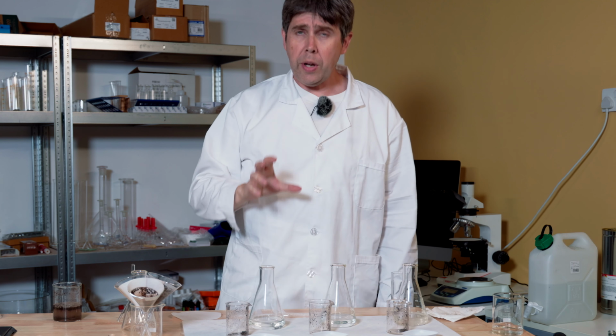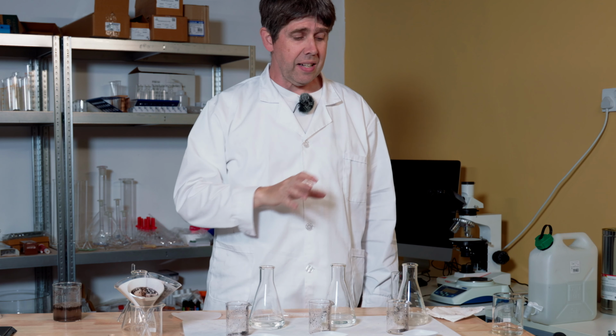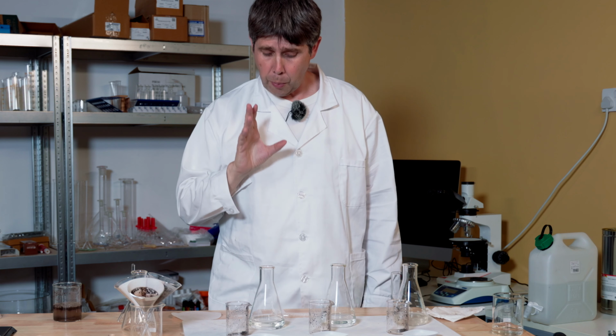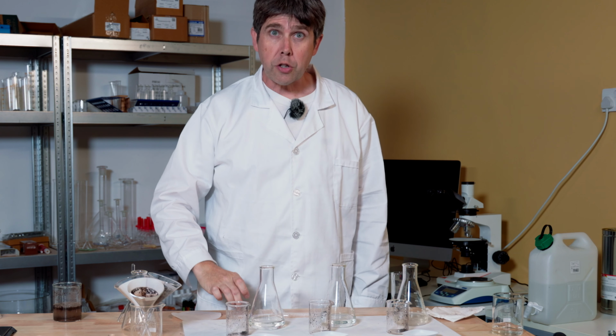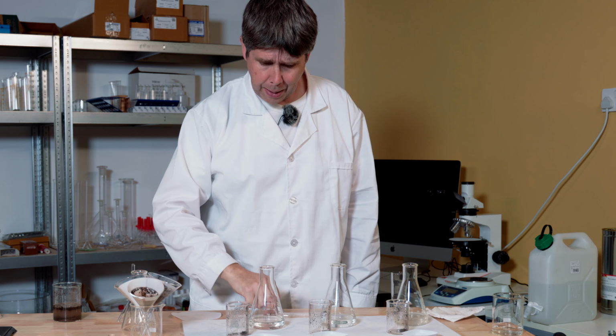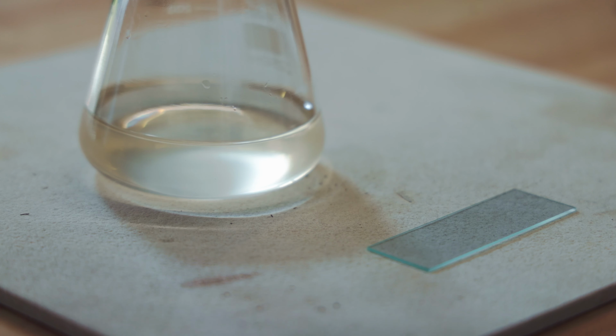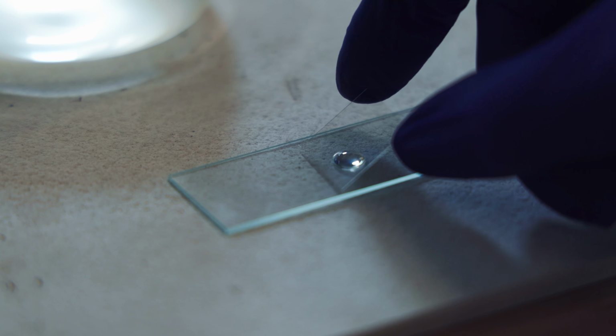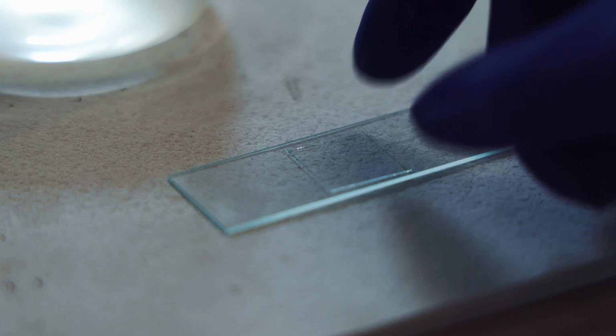But we're only going to know for sure once we get samples of these 3 filtrates under a microscope and have a closer look. So I'm going to take a little sample of each one. And we're going to have a look at a single drop of each of these samples under the microscope.